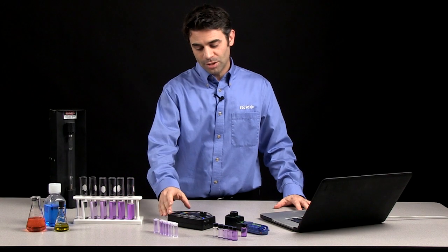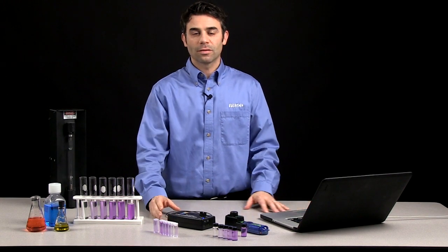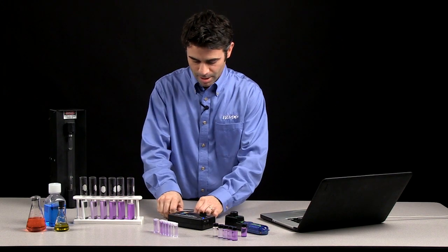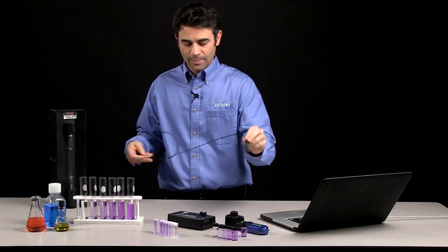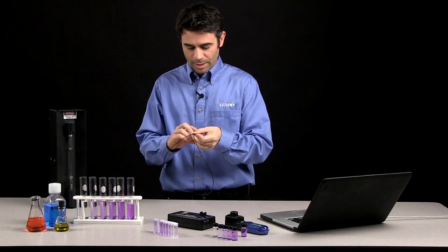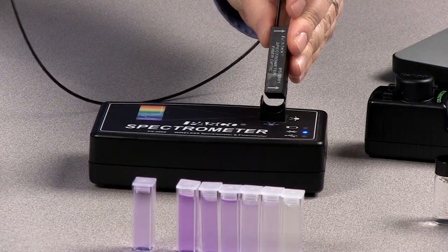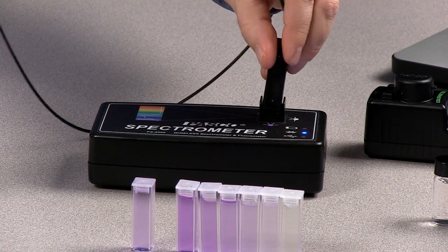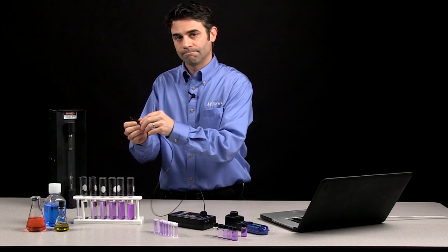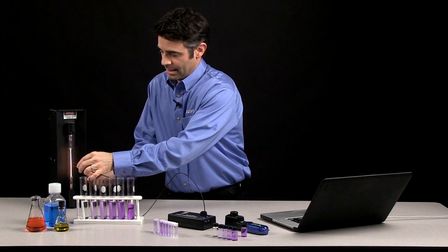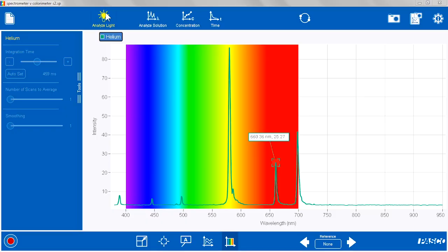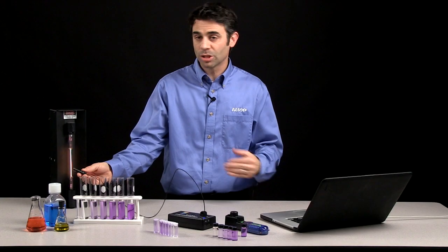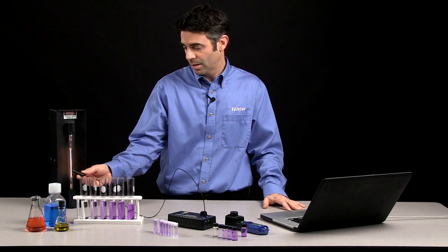There's an additional feature for the spectrometer that takes advantage of the fact that it is a full spectrum analysis. You can use the optional fiber-optic accessory cable, put it into the sample holder, and point that at light sources. And by doing that, looking at helium, I can go to the Analyze Light page, and I can look at the full visible spectrum of the emission of that particular element.